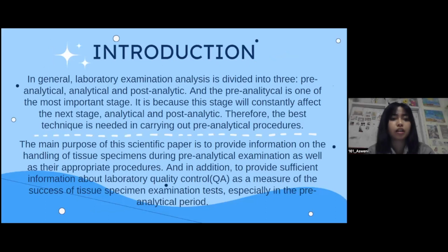The introduction is, in general, laboratory examination analysis is divided into three: pre-analytical, analytical, and post-analytical. And the pre-analytical is one of the most important stages. It is because this stage will constantly affect the next stages, analytical and post-analytical. Therefore, the best technique is needed in carrying out the pre-analytical procedure.